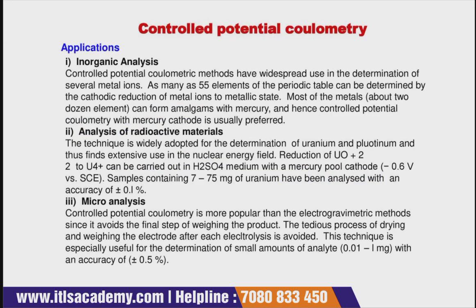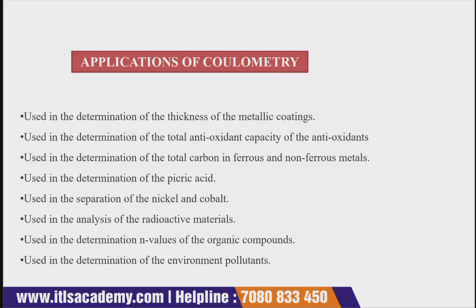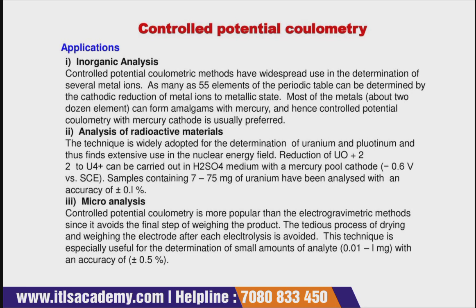Now comes the application of potentiostatic coulometry. The first application is inorganic analysis, the second is analysis of radioactive material, and the third is microanalysis.